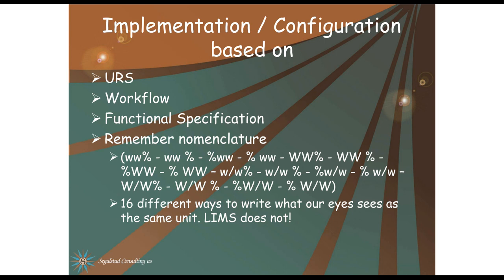First, the selection of LIMS is based on the written user requirement specification, also called a URS. You will choose the LIMS based on this. However, as each LIMS has so many different ways of solving your requirements, the supplier and you will generally create a functional specification to fit their system with your requirements. There will be several ways of solving them, and the supplier has good knowledge of how their system works. In your URS, you have also written something about your workflow, and this shall of course be implemented as well.